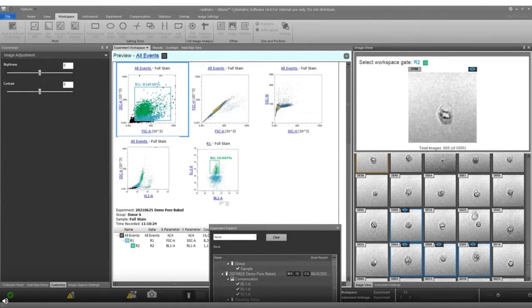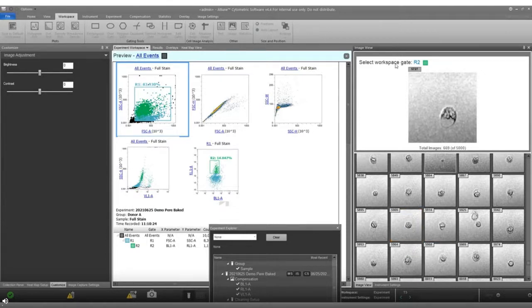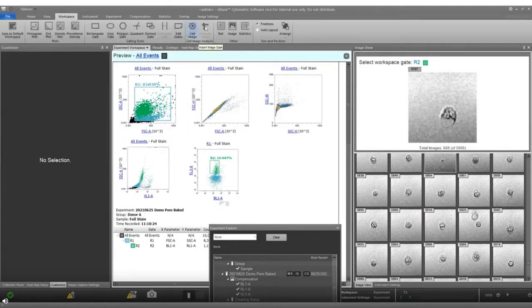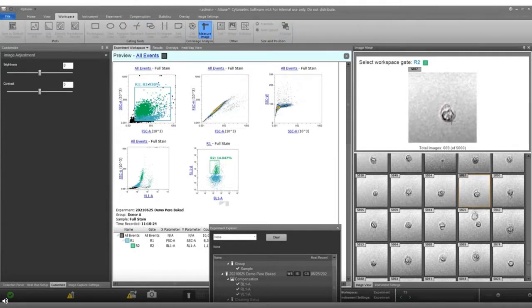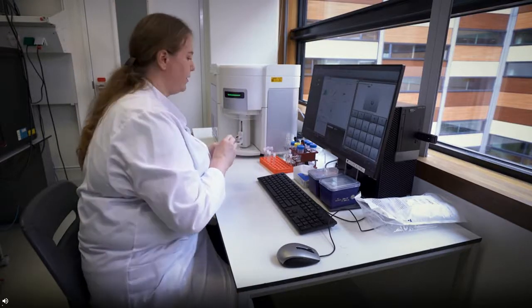So that's how you're able to view images. There's also a measurement tool, clear all images here, where you can actually see the size of each cell. And I am able to find the volume of our cell, or area of the cell, apologies. And we can, of course, back calculate to find the average diameter. And you also know the number of pixels as well. So measuring the cell size is quite easy on the system.